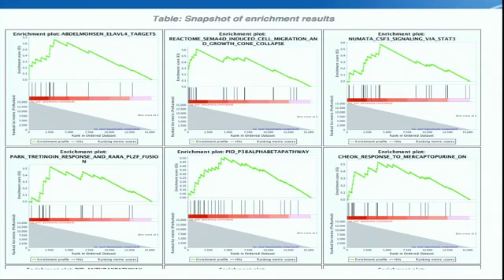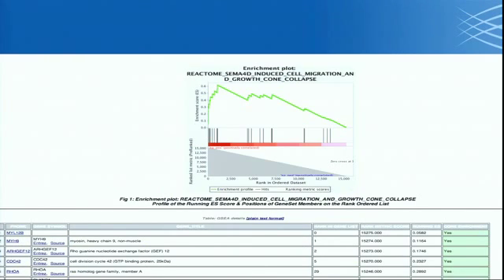For example, if we were to run some Achilles data on a cell line and ask what genes are highly depleted in my list, you'll find a lot of ribosomal genes, of course, are depleted. Ribosomal genes are essential, so a lot of them fall at the very bottom of your list of abundance in an Achilles screen. You can also click around and get reports for what these lines are, what the genes are.